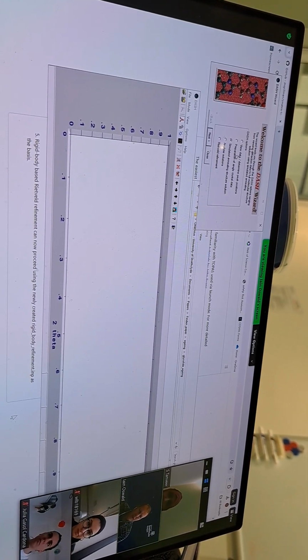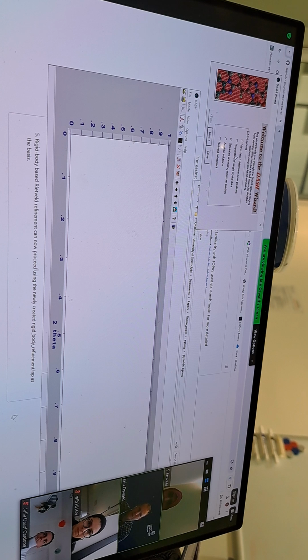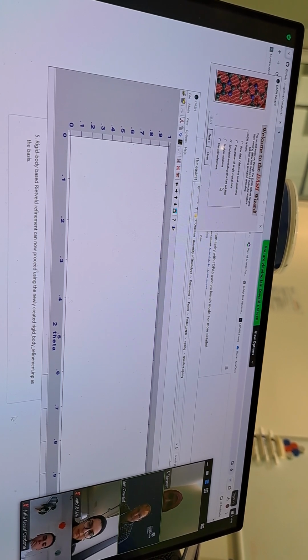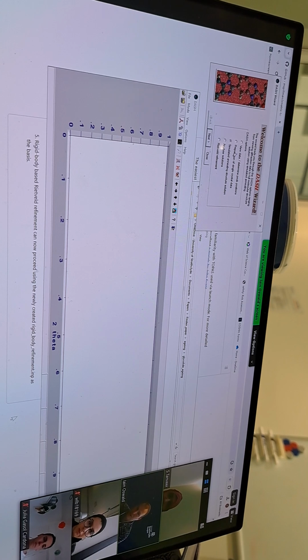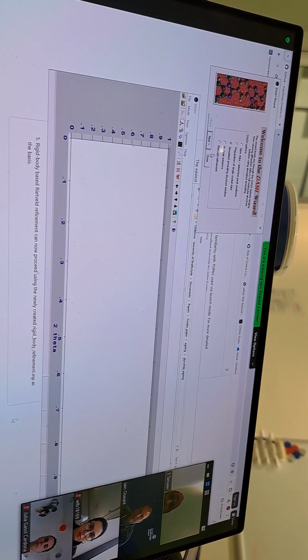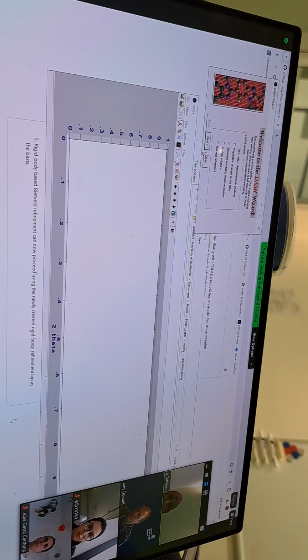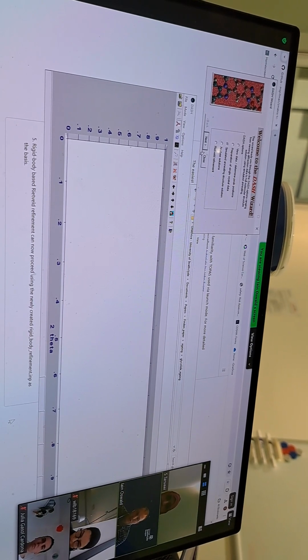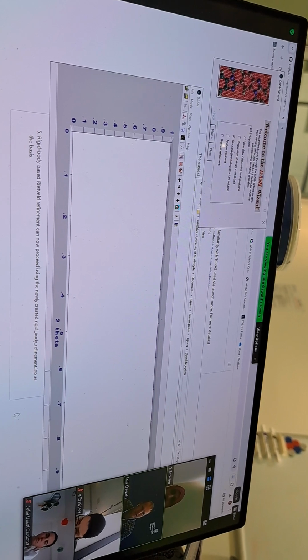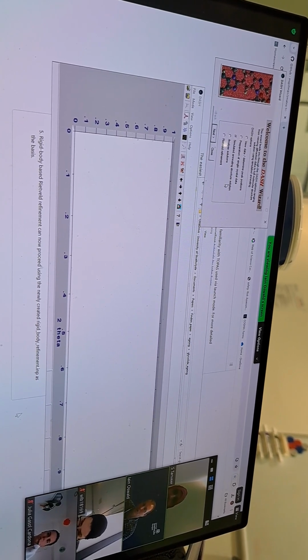So we can go through, for each of your powder patterns, this process of viewing data and then determining peak positions and so forth. By doing that, you get a .sdi file out, which is all the information that you've got to that point. Otherwise, you can skip to this simulated annealing structure solution.